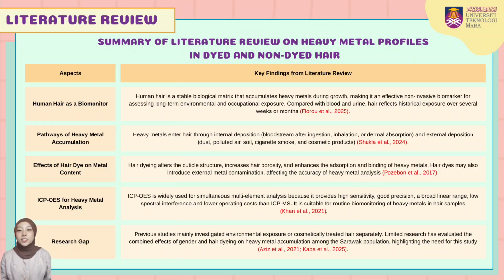Previous studies also reported that hair dye treatment changed the hair cuticle, increased hair porosity, and enhanced heavy metal absorption. As a result, dyed hair may contain higher concentration of heavy metal than non-dyed hair. Several environmental and lifestyle factors, including smoking habit, occupation, diet, and cosmetic use, also influence heavy metal accumulation. Among the available analytical techniques, ICP-OES was selected because it allows simultaneous multi-element analysis with high sensitivity, good precision, and lower operating costs compared with ICP-MS.